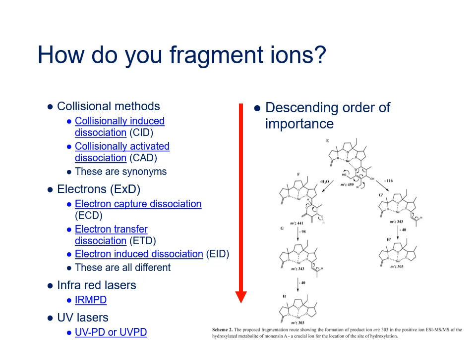In this method, the ultraviolet photons each carry enough energy to generate photoelectrons from the molecule you're trying to fragment. And of course, having knocked an electron out of that structure, what's left behind is a radical, and that can then go on to spontaneously fragment.